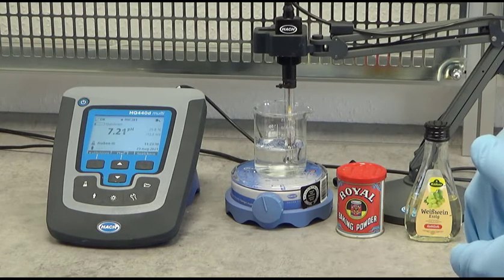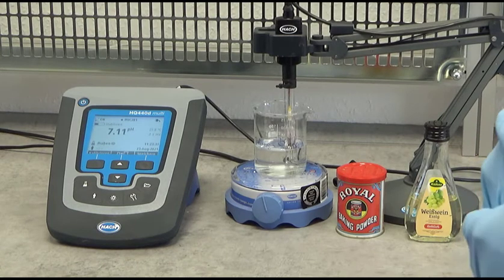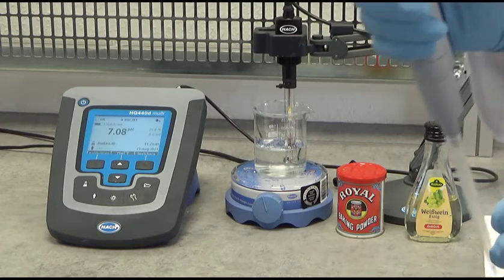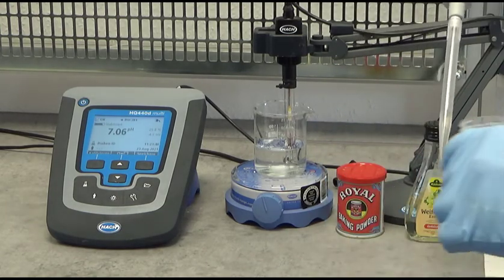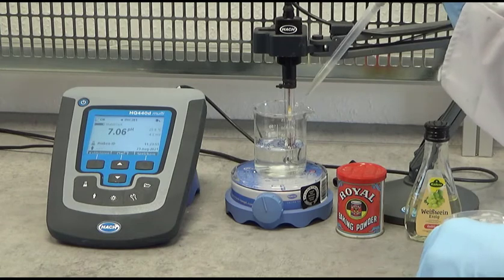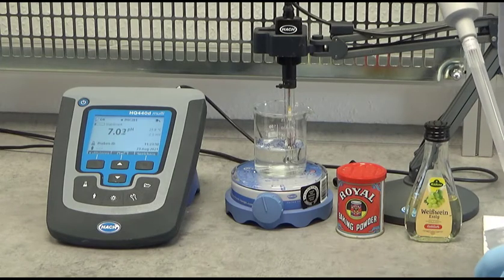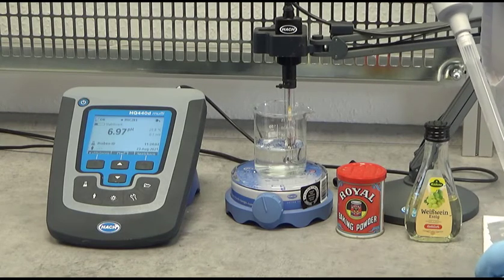The pH is stabilizing at approximately 7.2 to 7.1. Now I will proceed the same way as with the previous sample and add some drops of vinegar. Remember, with the previous sample I added only three drops and the pH dropped significantly. We are at 7.06 now and I add one drop of vinegar. It reacts a little bit, but not that much — we are still at 7.